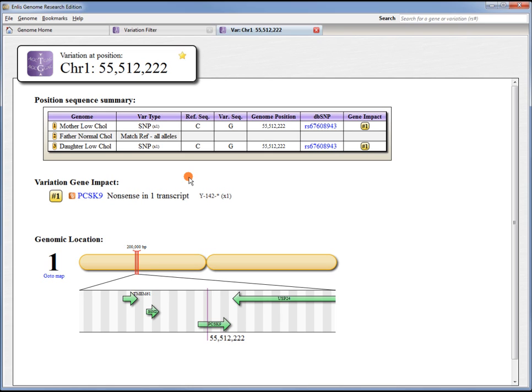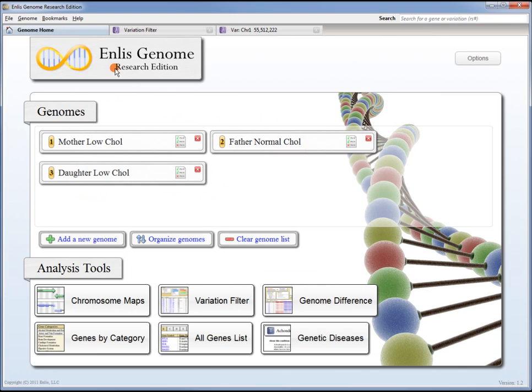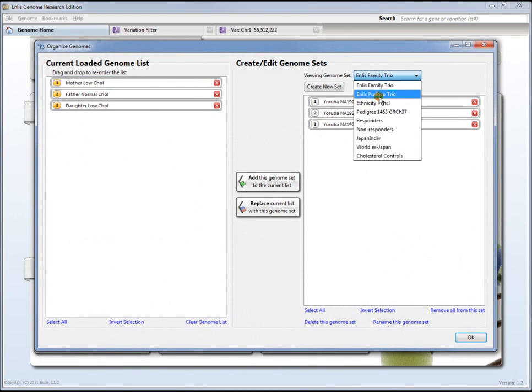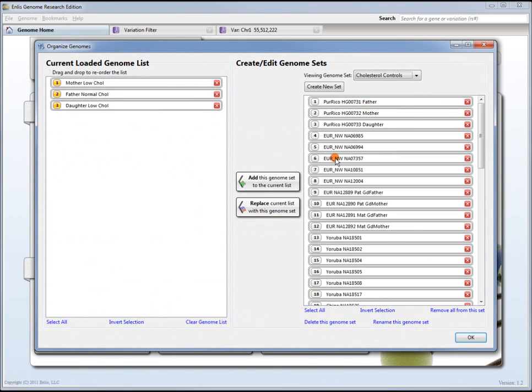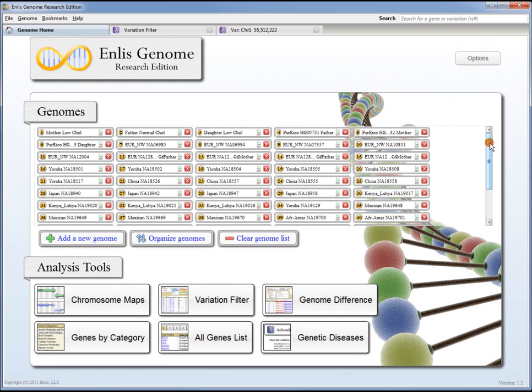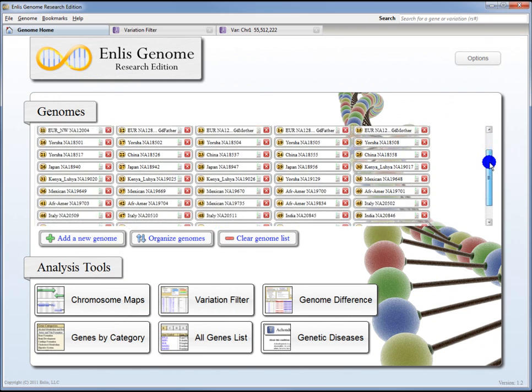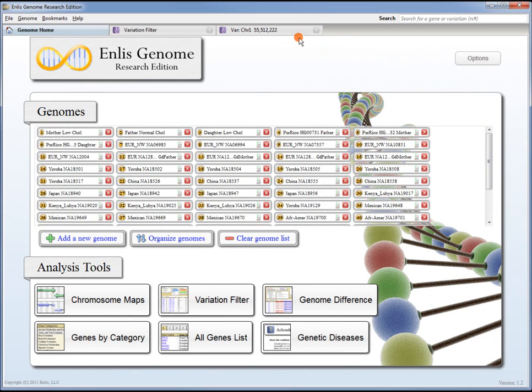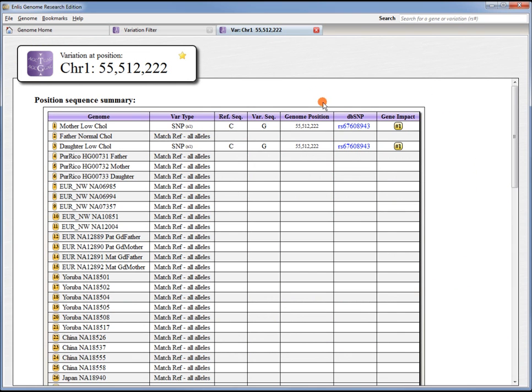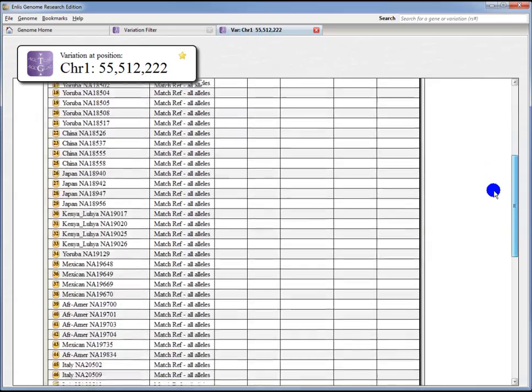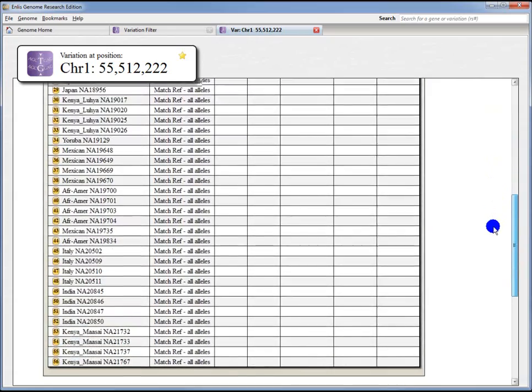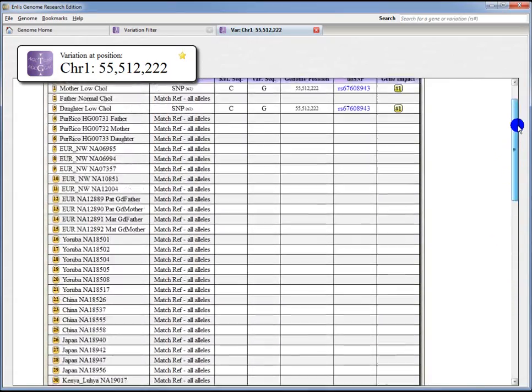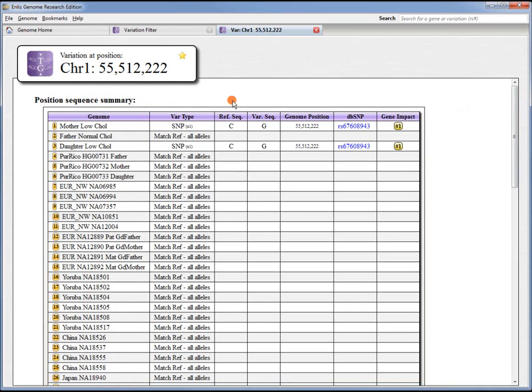Remember, we also searched 53 control genomes, but we didn't have to load those into the program. If we want to view those 53 genomes as well, we can do that very easily. We'll come in here and select that cholesterol control set and say add this genome set to the currently loaded list. That quickly we've loaded up those 53 genomes in addition to the three that we are already viewing. Switching back over to the position page, we can see all of those genomes listed, and see that they match reference on all alleles just like the father. So, none of these genomes share this variation with the mother and the daughter.